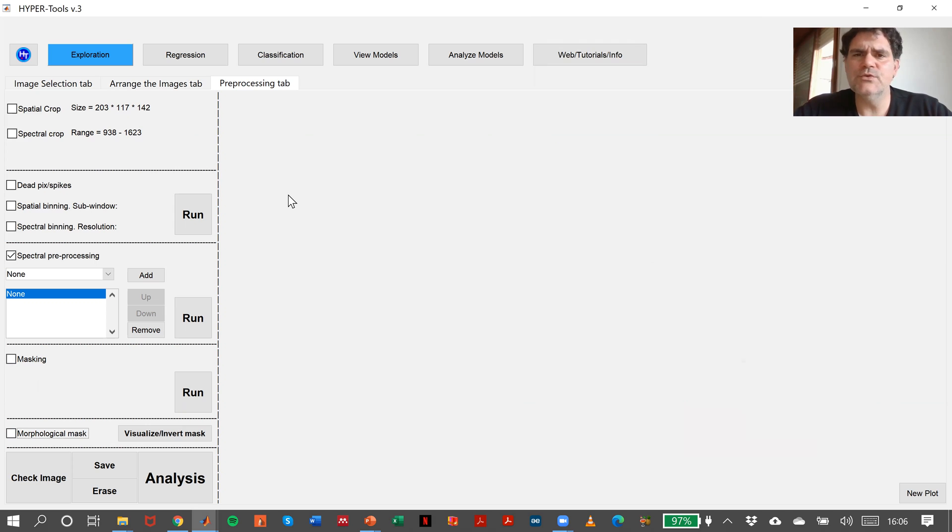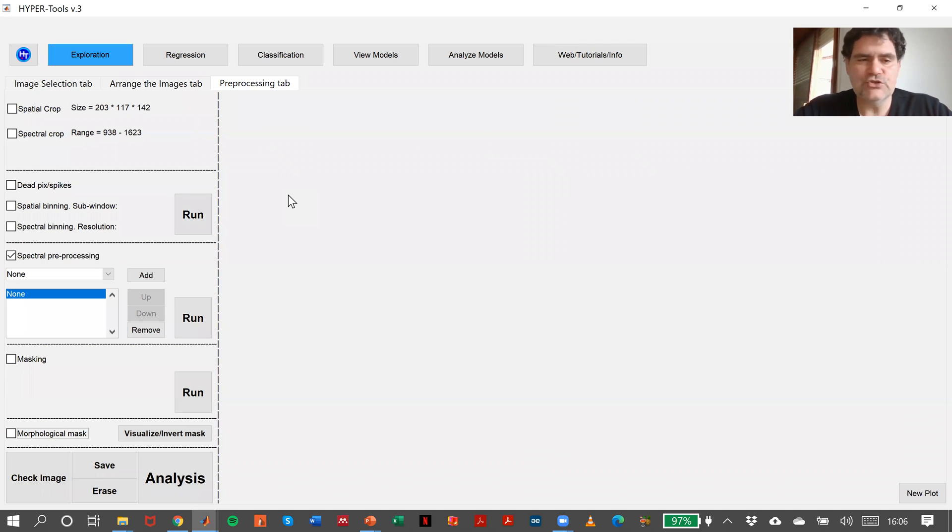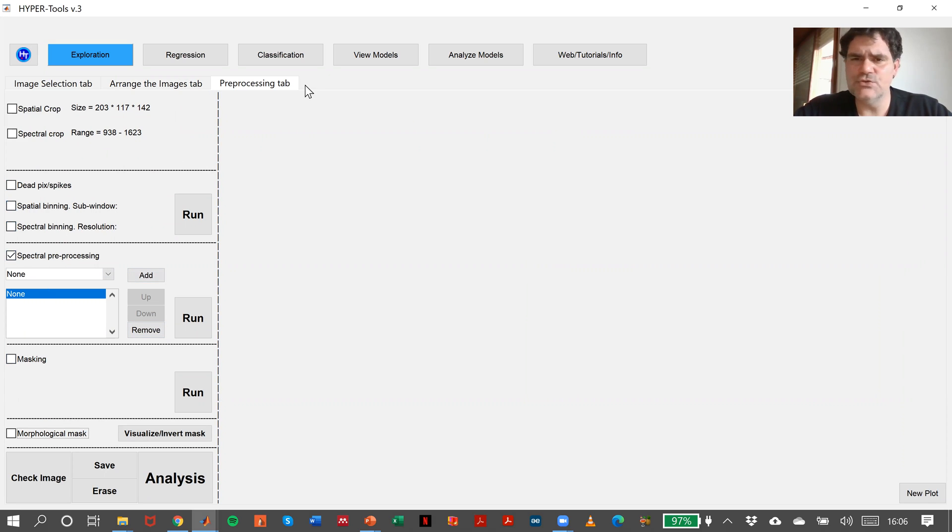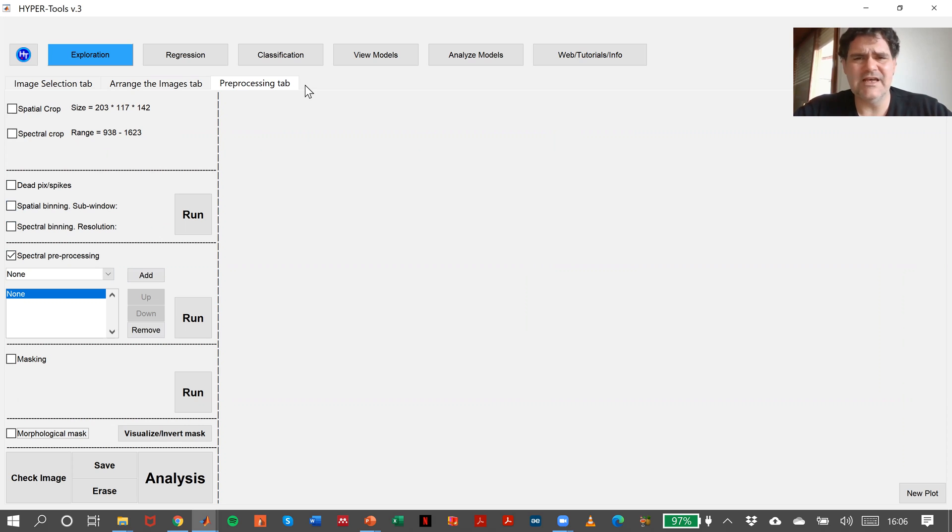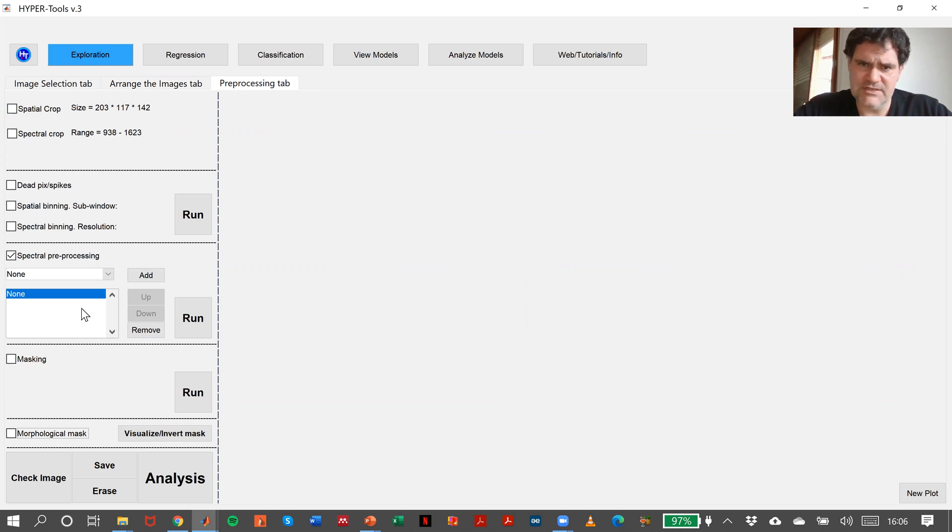In order to illustrate how preprocessing works, you can apply as many preprocessing steps as you need. It really depends on the case that you want to study. If you want to make a spatial crop and then spectral preprocessing, you can do it.